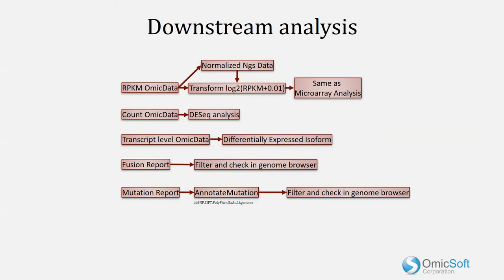After aligning your RNA-seq data, you can perform many downstream analyses in Array Studio, but many of these analysis modules require additional normalization of the data.